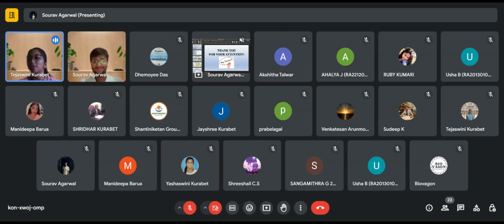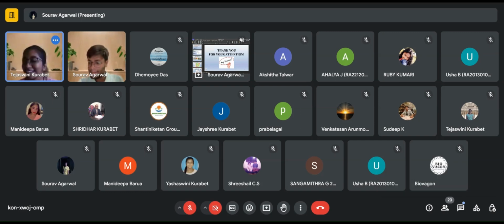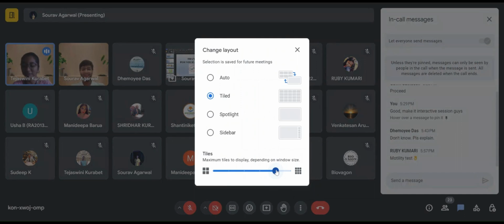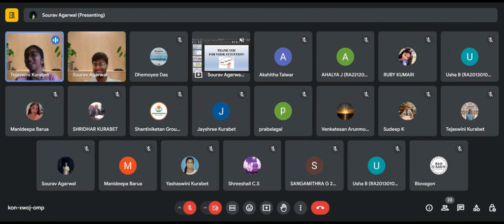Have you guys performed this during your college laboratory time? Motility test, okay. Did you get the results when you performed it? I'll tell you a personal thing: when we were doing the motility test, not once did we get the results properly. Either we added too much media onto the cover slip, or when observing it under the microscope, because of the cavity slide, we broke the cover slip. All these things have happened. So according to me, motility is the toughest of all the tests. True, while performing, it's the toughest, because the media should literally hang in the cavity. Otherwise, you won't see the organisms moving.